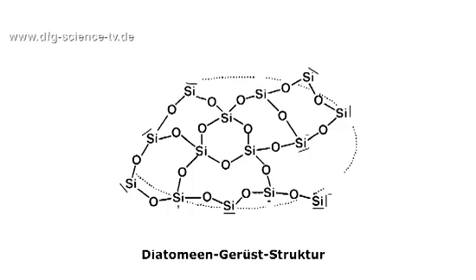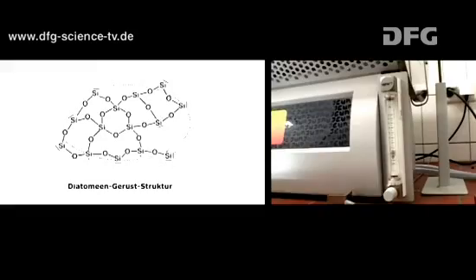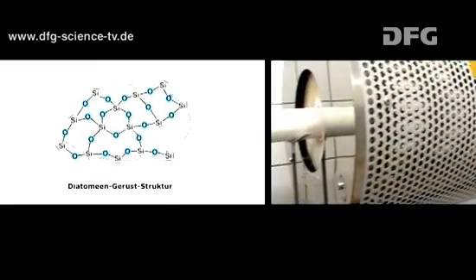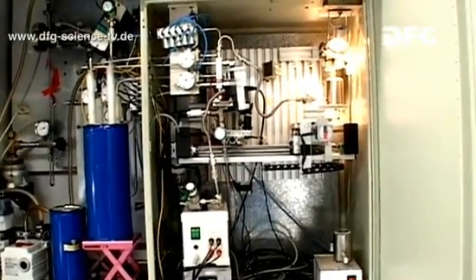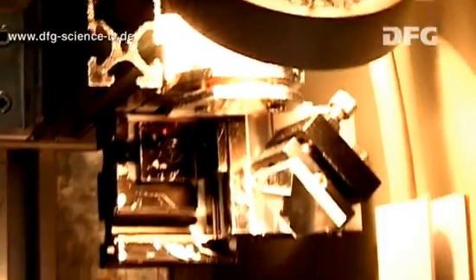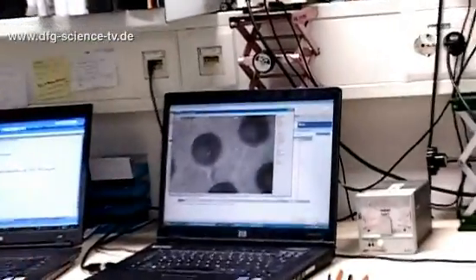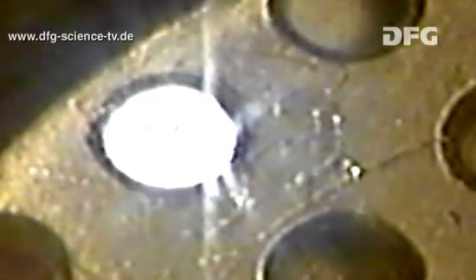Hydroxyl groups, which could distort the results, are removed in a helium-percolated furnace at 1050 degrees Celsius. This process takes 6 hours. Only after this, the final stage before the analysis can be completed. Using a laser beam, every single sample on the algae-filled nickel plate is vaporized. The resistant silicon-oxygen bonds are cracked with the aid of the highly reactive gas bromine pentafluoride.